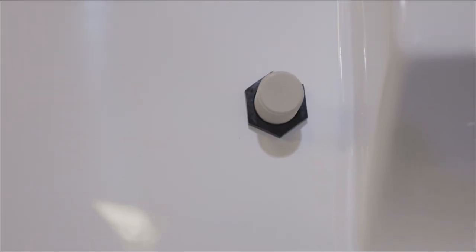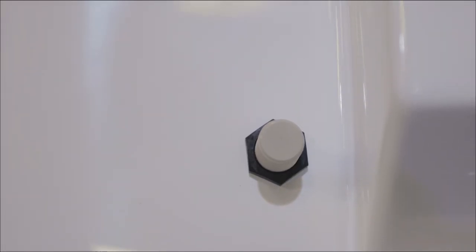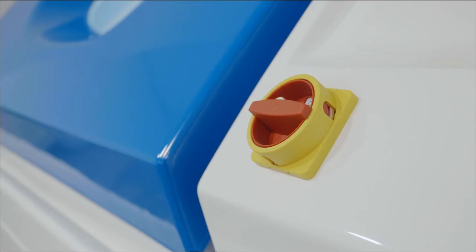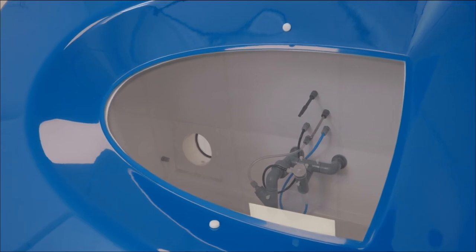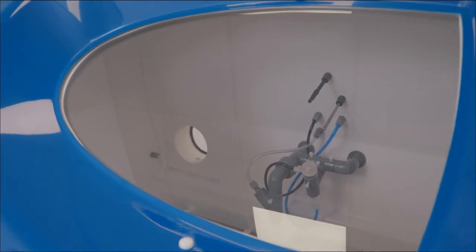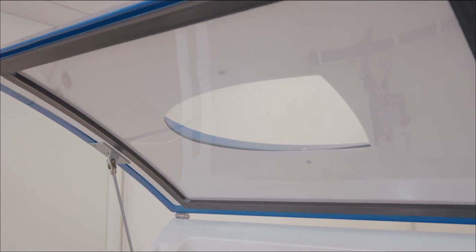We have sensors on the inside and outside of the chamber body to monitor the position of the canopy should it open or close inadvertently. The canopy has a large viewing window allowing clear access when viewing samples being tested.